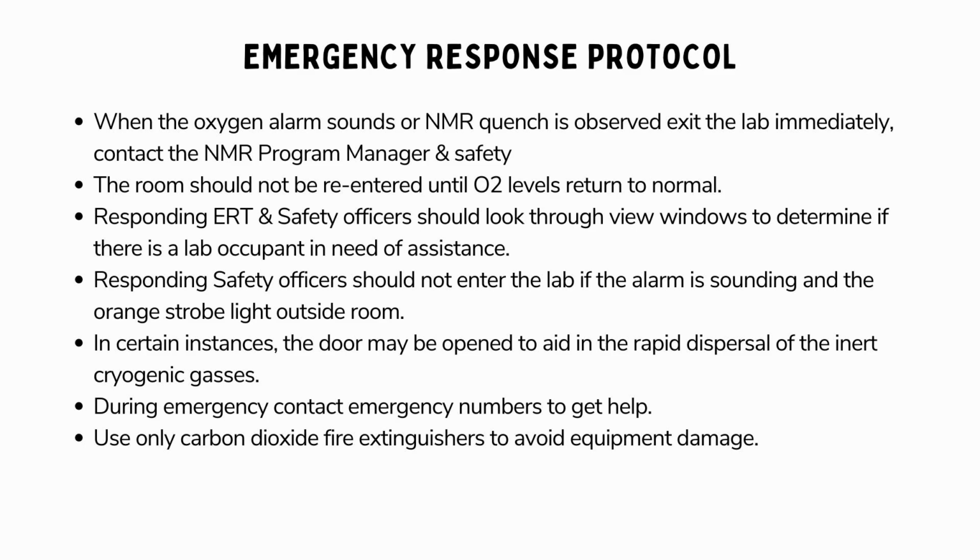Emergency Response Protocol. Upon hearing the oxygen alarm or observing an NMR quench, evacuate the laboratory immediately and promptly notify the NMR program manager and the safety team. Do not re-enter the room until oxygen levels are confirmed to be normal. Emergency response teams, ERT, and safety officers must assess the situation by looking through viewing windows to check for any individuals requiring assistance within the lab.